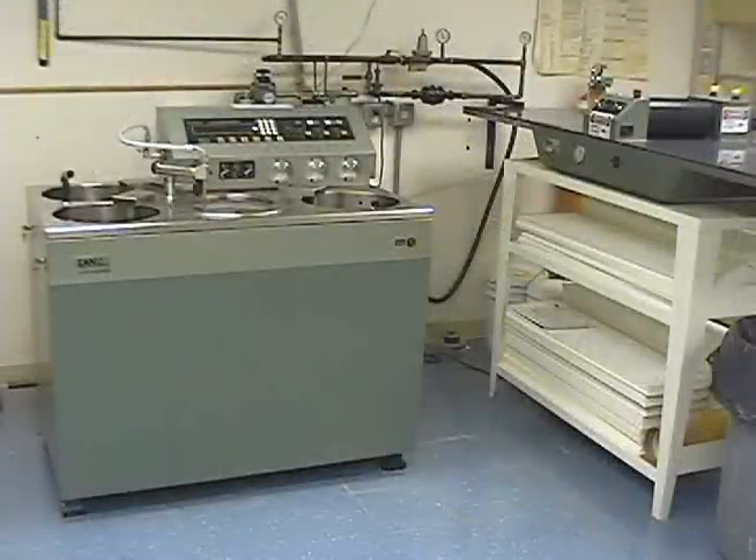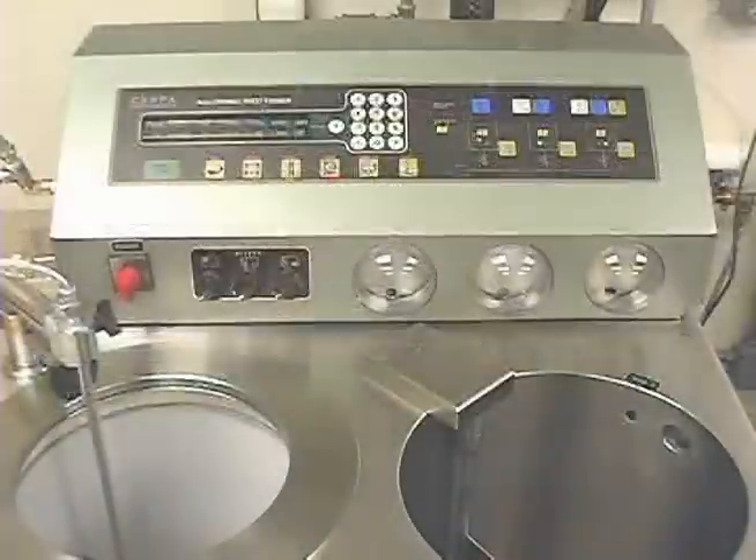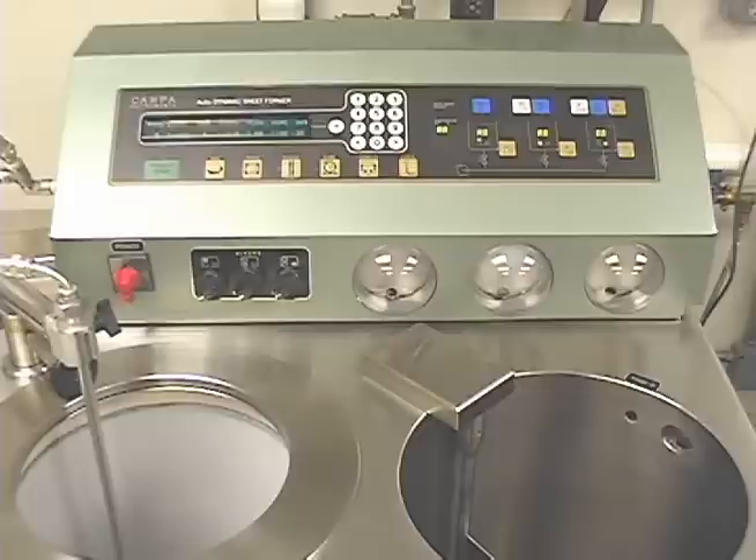The dynamic sheet former and press from Campa Instruments are used to produce 1 meter by 30 centimeter sheets with properties similar to that of paper made on a commercial paper machine. Sheets of desired fiber orientation are made by setting the variables to obtain a desired jet-to-wire ratio. DSF sheets are used to research into paper properties, forming fabrics, additives, and grade development under realistic conditions.